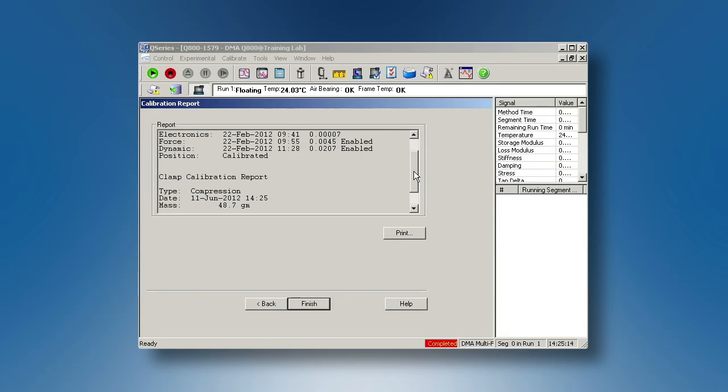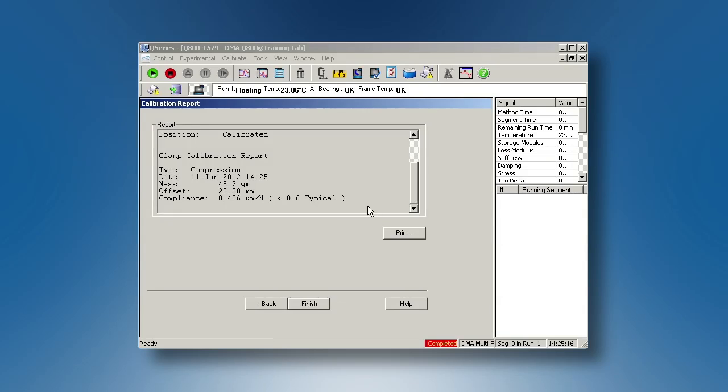Make sure the clamp compliance value is lower than the maximum value that is shown on the right side of the screen. You have now finished the compression clamp calibration.